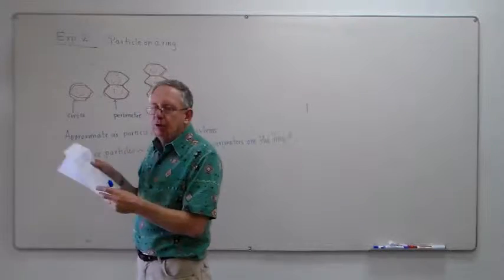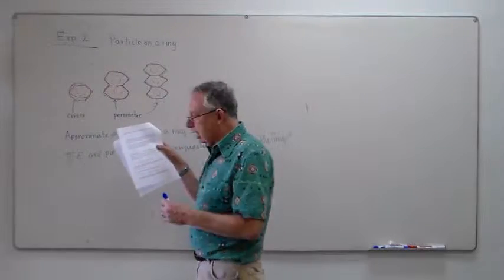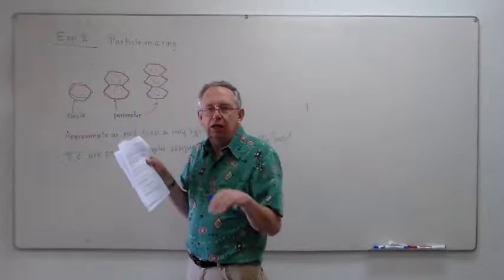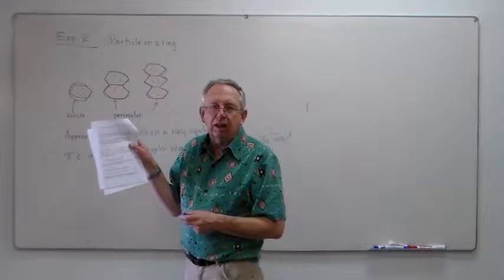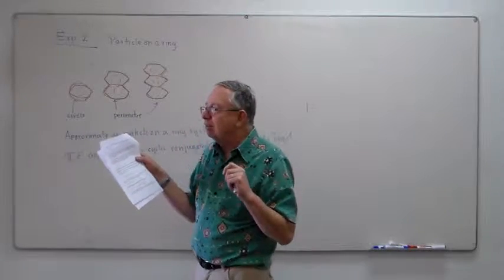And if you turn to equation 6, you'll find that the end result of all this analysis is that the wavelength of the light that induces a transition from one quantum state to the other is proportional to the length of the linear box squared.